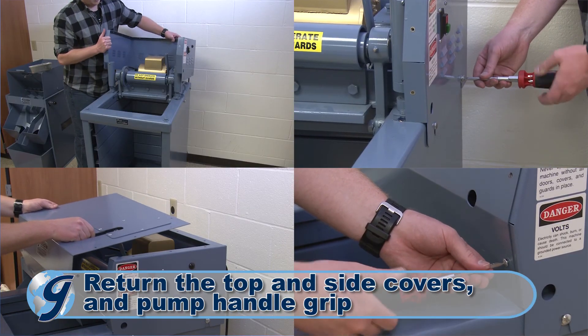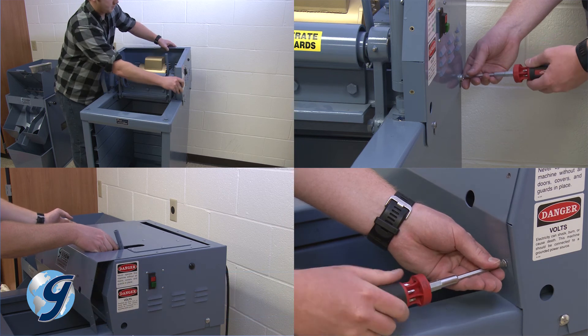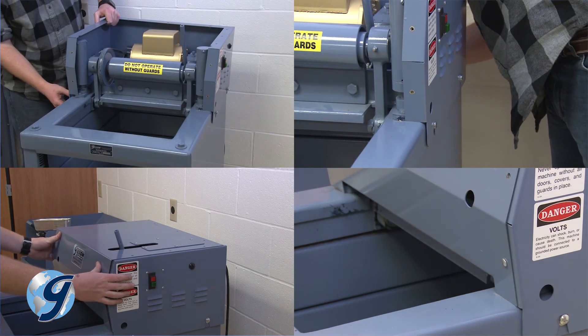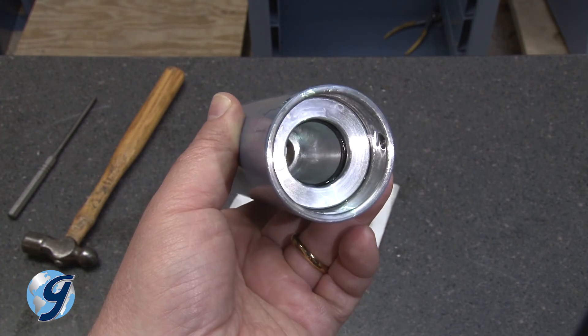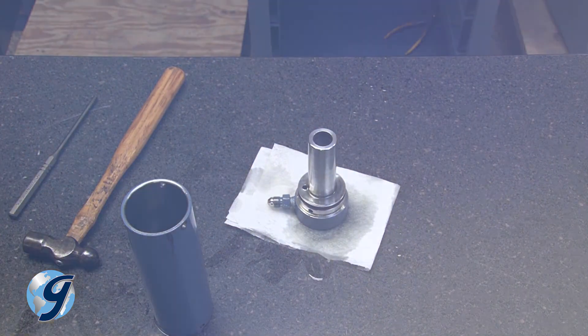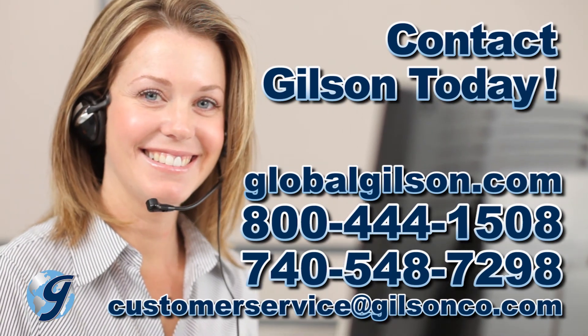Remove the pump handle grip and return the top and side covers, then re-install the pump handle grip. After fully re-assembling the unit with covers installed, run the unit empty for a few minutes. The testing screen should run freely and quietly. For any questions on the hydraulic system of your testing screen, or for any Gilson product, please contact your Gilson Technical Support Team.